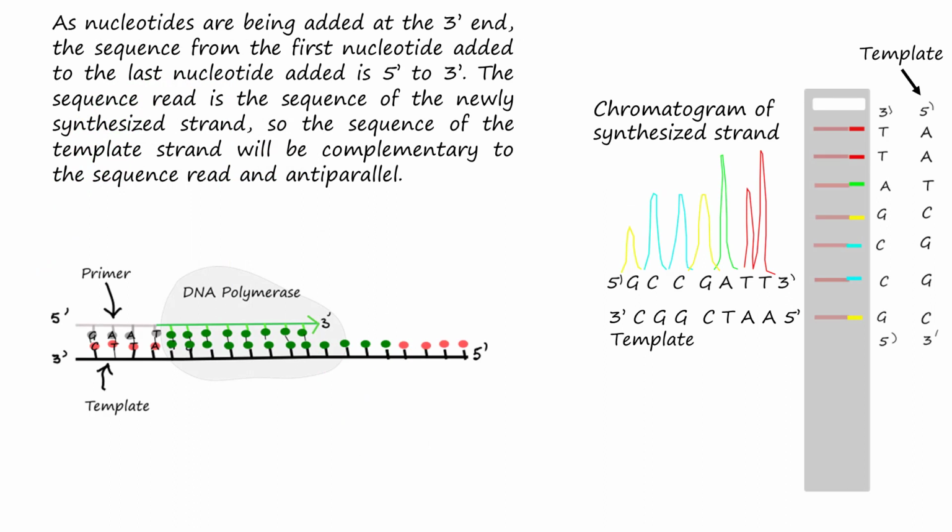As nucleotides are being added at the 3' end, the sequence from the first nucleotide added to the last nucleotide added is 5' to 3'.